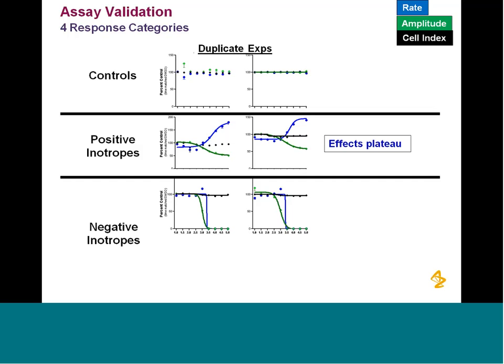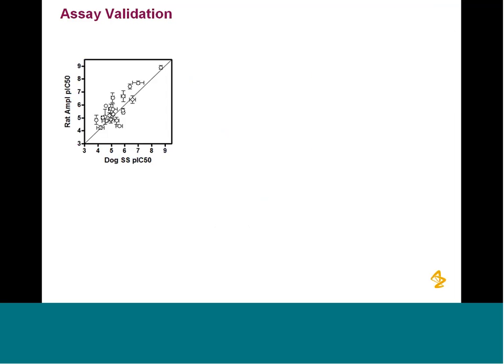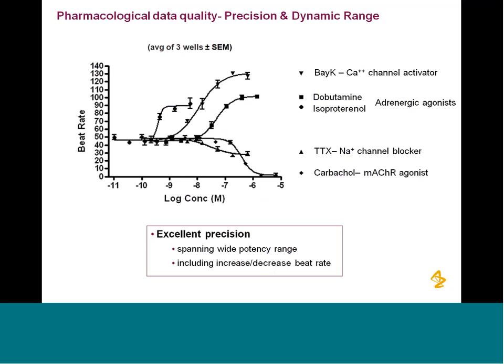Okay. Also, a very specific question: in the assay development, the very first dose response slide you showed, which had the nice dynamic range and so forth, it showed the Bay-K effect. Is that in the rat primaries? Yes. Okay, that's rat primary data. Okay, that was the very simple question. And finally, just kind of a clarification, are you then using the data you showed, amplitude and or rate as the primary drivers for screening, or a combination of the two, or on a case-by-case basis?